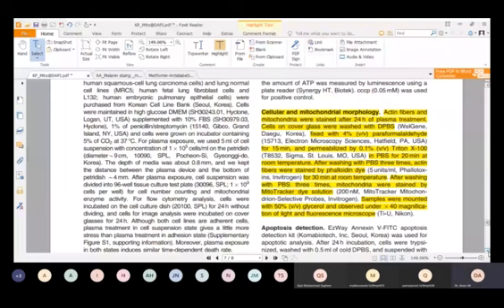So their sample is a plasma treated sample, and now they wanted to stain and see what is the plasma effect on the cell morphology and mitochondrial shape and structure. To investigate this, they used the staining technique. So let's read this.